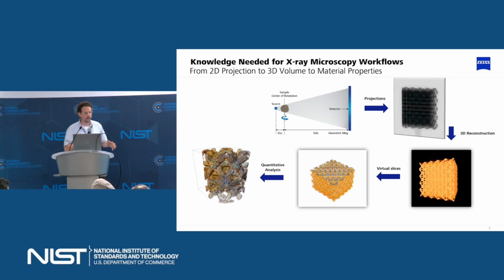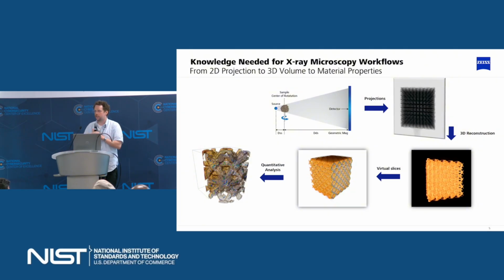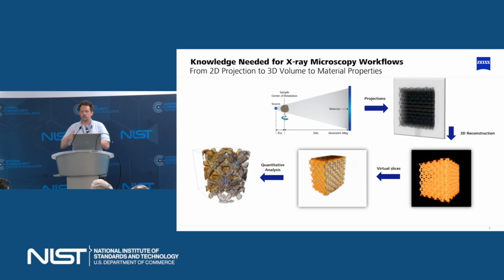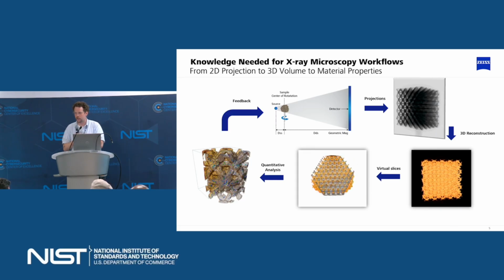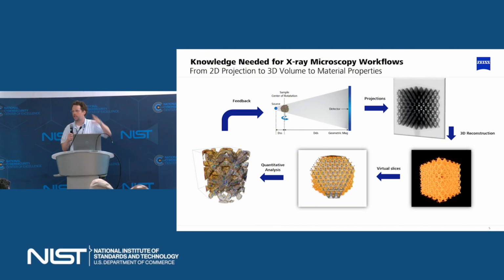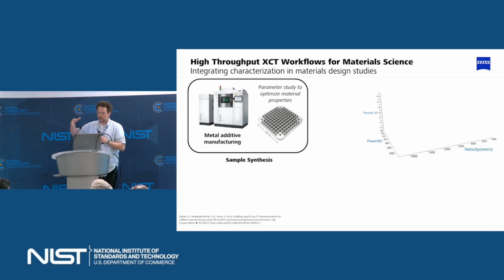It's pretty rare, however, that the workflow stops here. Typically, your first acquisition is not your last acquisition. You need to do some tuning of your parameters, or you want to zoom in on a specific feature. So you do, and then you do more data acquisition. And there's one particular type of workflow that I'm targeting with this automation tool.